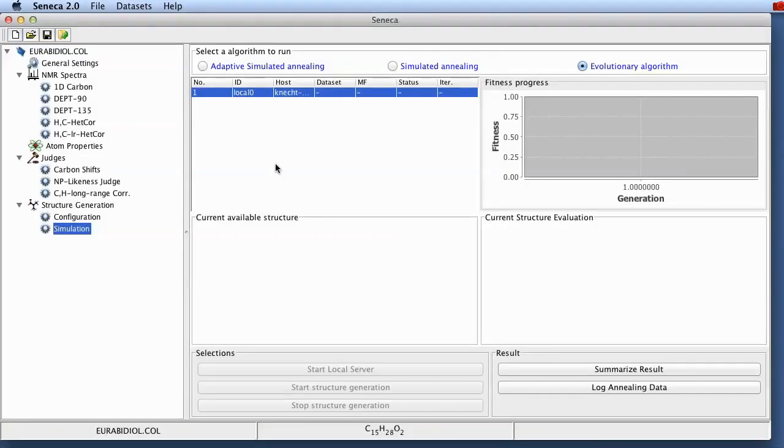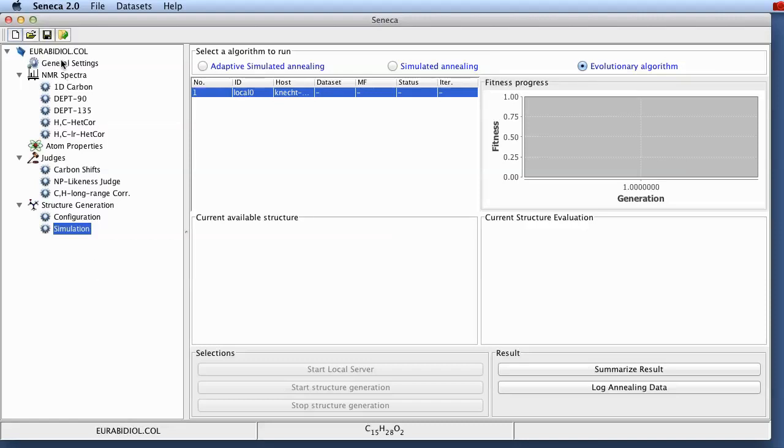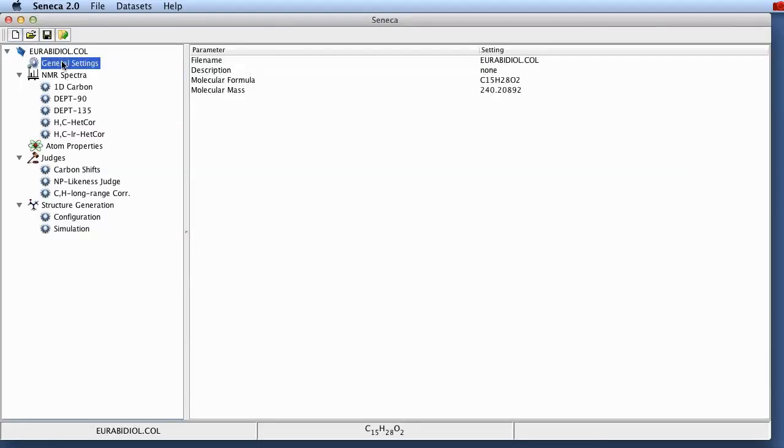These example files can be downloaded from the SourceForge website as a zip file or they will also be included in the next release of the DMG file. Okay so here we've got all the information that is available for the Eurabidiol structure elucidation case. Let's go from top to bottom and look at all the different types of information that are available.